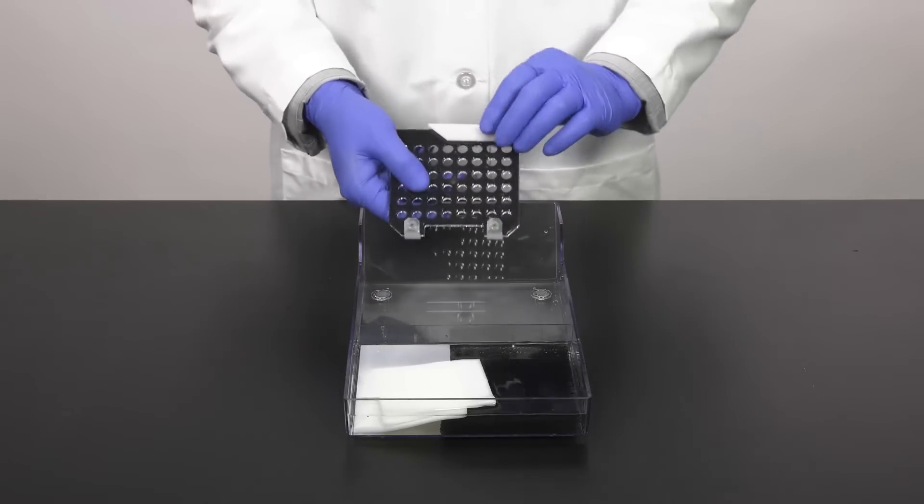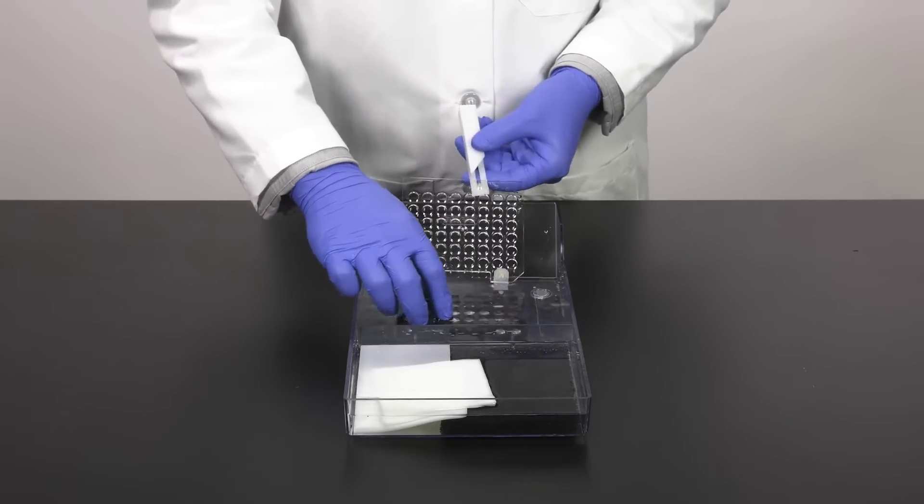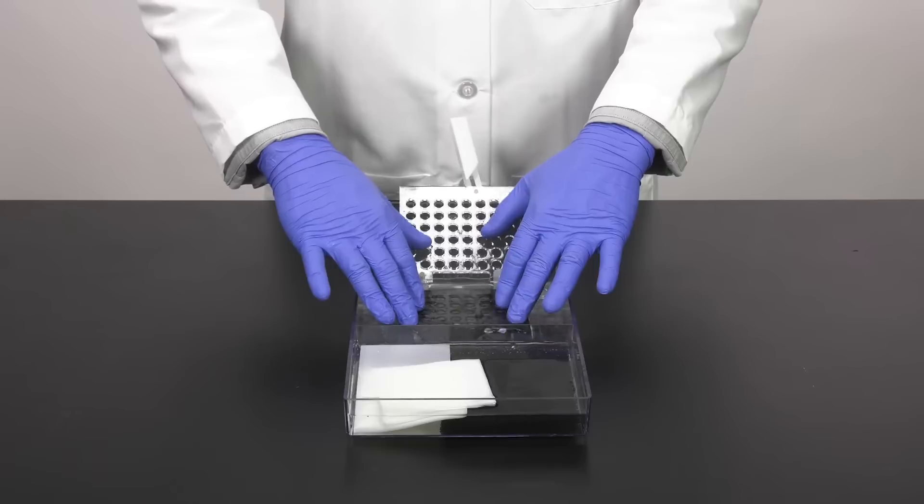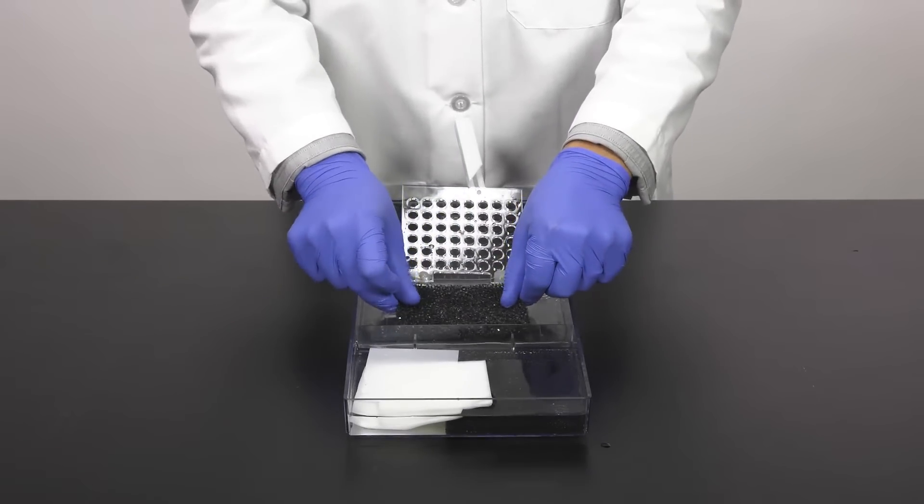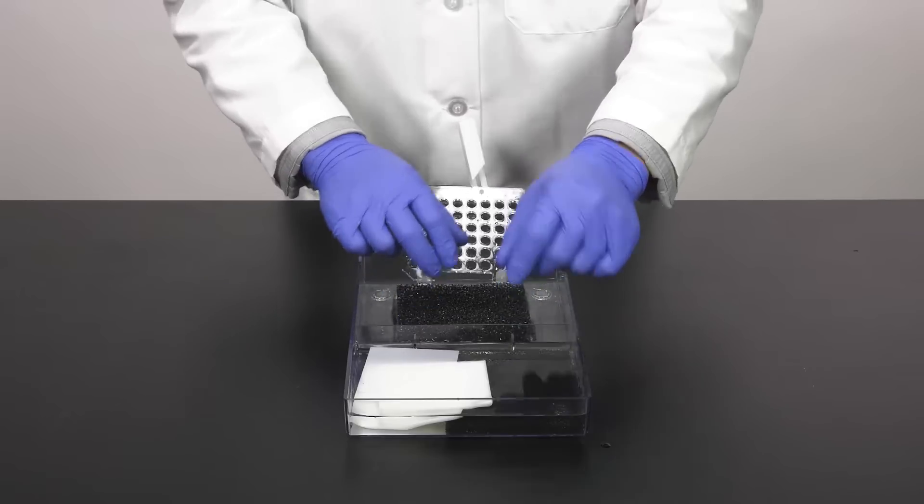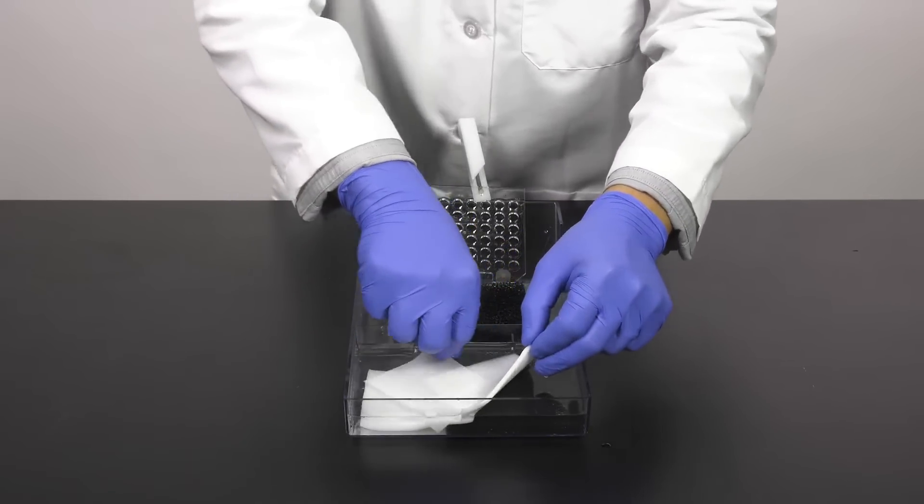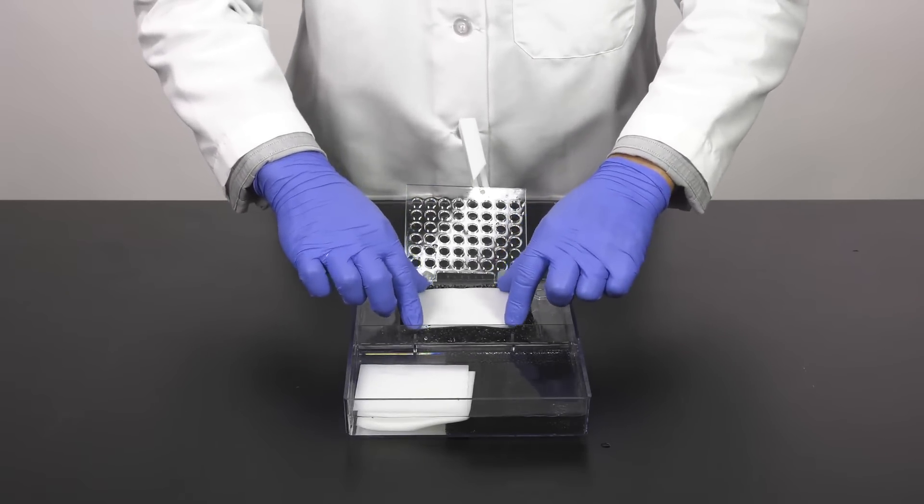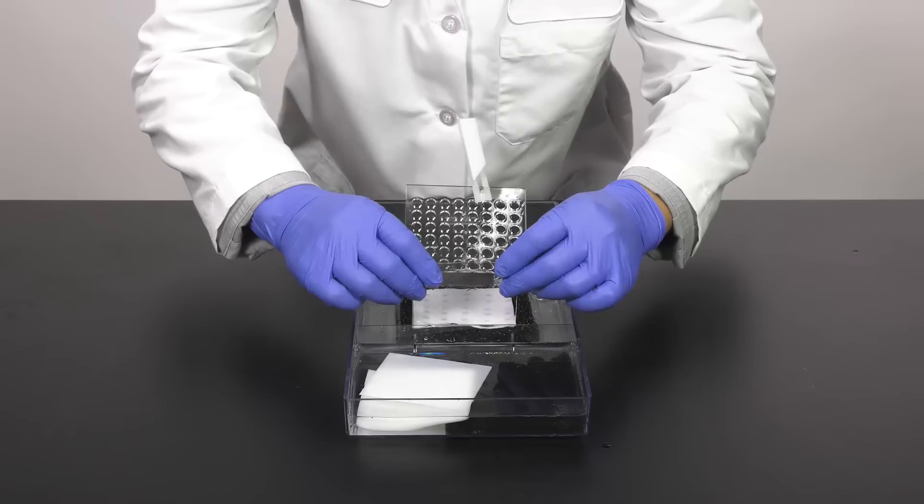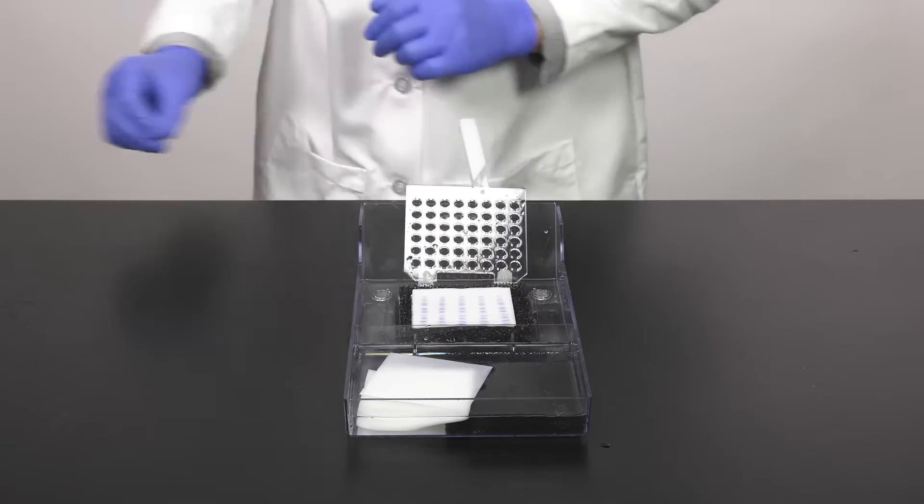To make the blotting sandwich, place the gel holder cassette with the black side down in a tray with sufficient transfer buffer. Place one pre-wet fiber pad onto the black plastic, followed by a pre-wet sheet of blotting paper. Take the gel and carefully place it onto the blotting paper, being careful to avoid trapping excessive air bubbles.